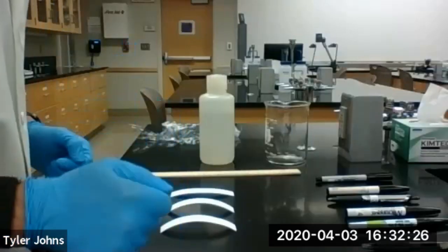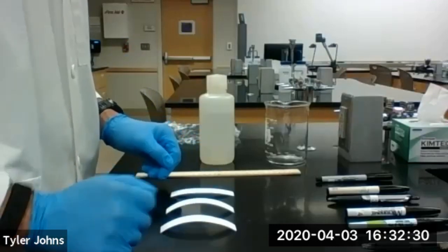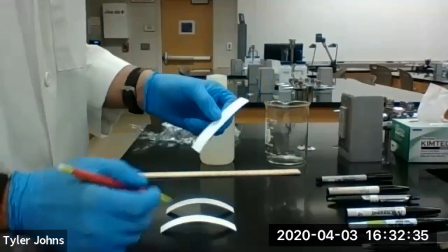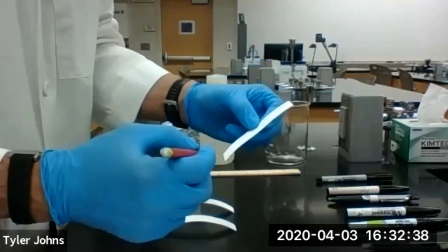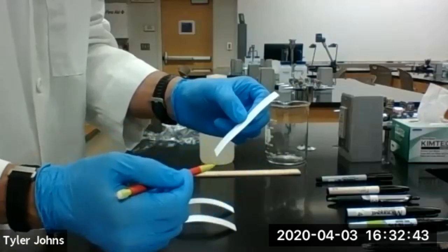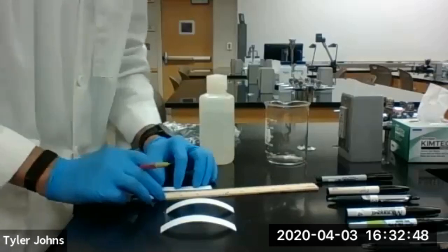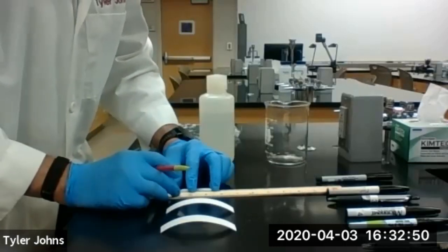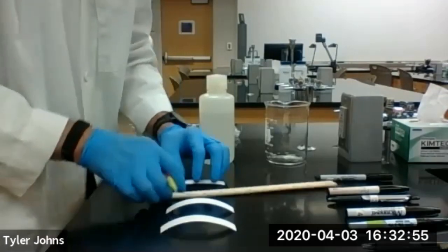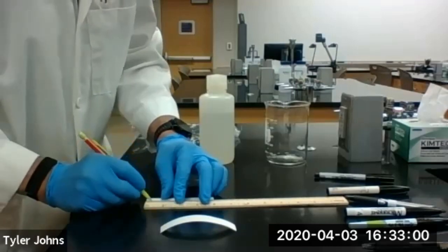We need to find out who that thief in our class is. The first thing we're going to do is take chromatography paper. This chromatography paper will allow the ink to separate as we use a solvent to migrate up the chromatography paper. On our chromatography paper, we're going to draw a line across about one centimeter up from the bottom, and we're going to do that on all three pieces.